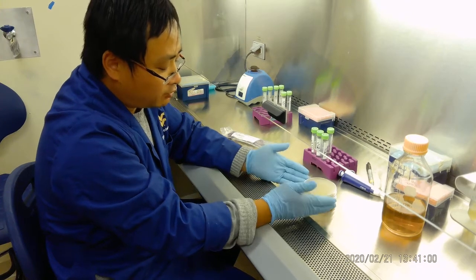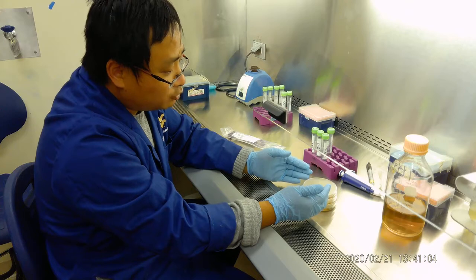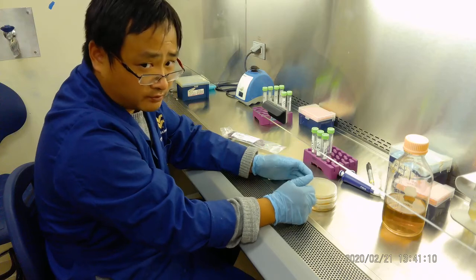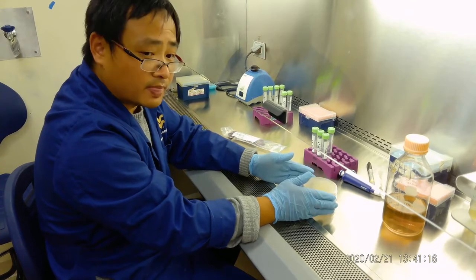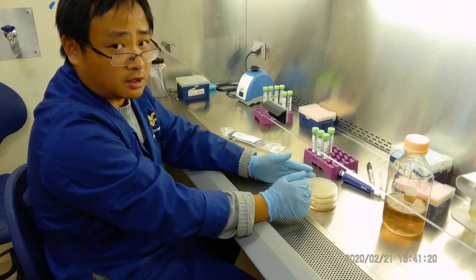But basically, usually we stack like this to do the incubation, then after 1 day we flip it over, because the solidified agar may fall off if you flip it over too quickly. Okay, now the same thing, we're going to show you how to count colonies afterwards, but let's finish these here. So this is what I'm showing for the spread plating and the pour plating. Okay, thank you.